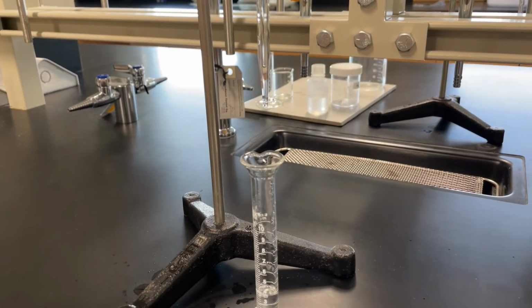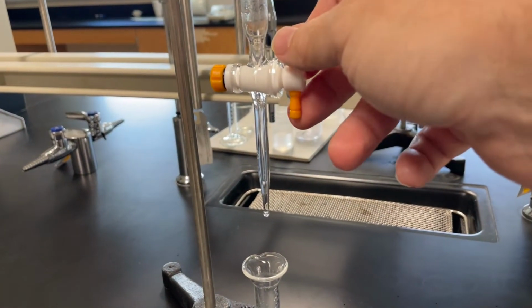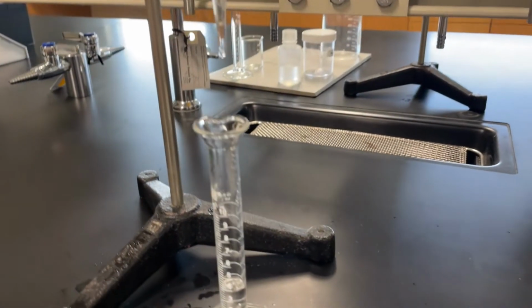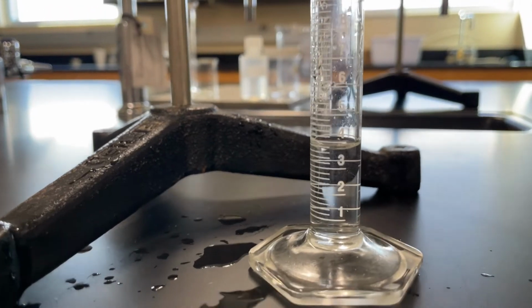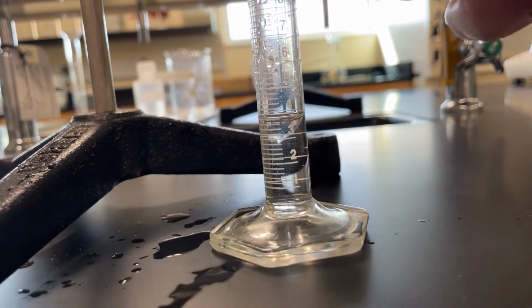You'll notice that there was some dead space in our burette where there are no milliliter signs, and so we needed to record that bit of volume as well. So we filled it up with water, we emptied it into a graduated cylinder, and we see right here that we have the volume for that dead space. So we have the volume of our H2 gas, but we also need to account for that dead space, so we're going to need to add this to it to get the total volume of gas.